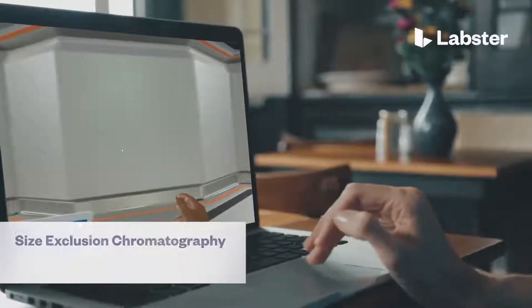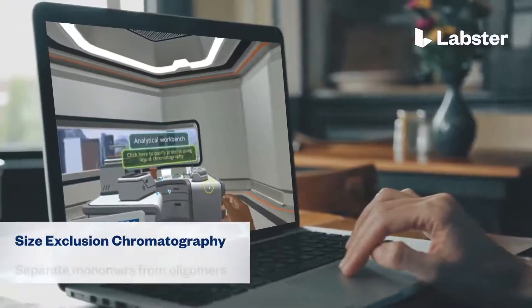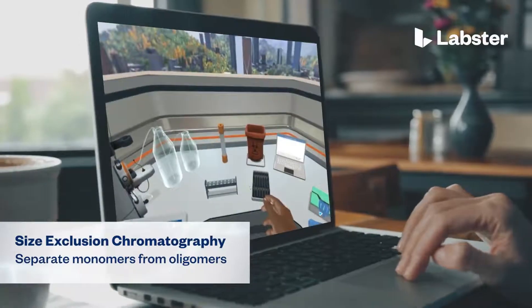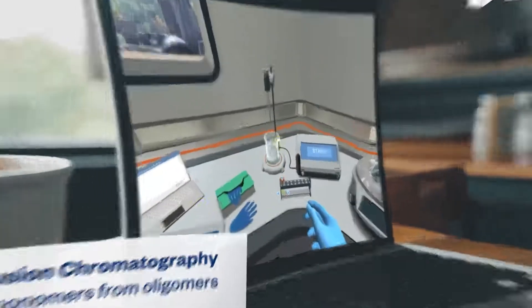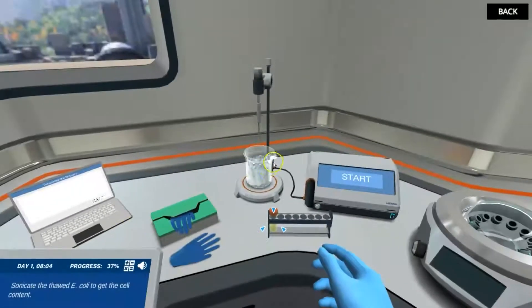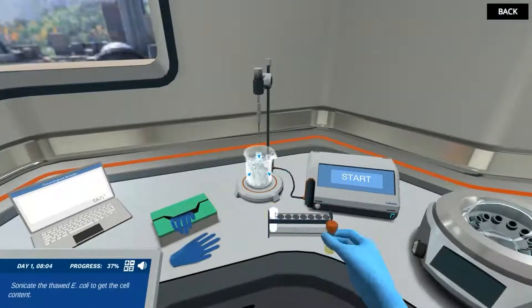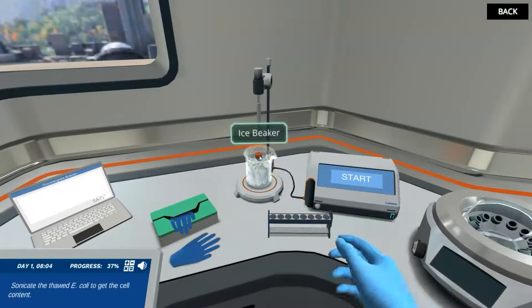In the Size Exclusion Chromatography Separate Monomers from Oligomers Virtual Lab, students step into a realistic lab experience where they can practice, learn, and explore science in an engaging and immersive way.